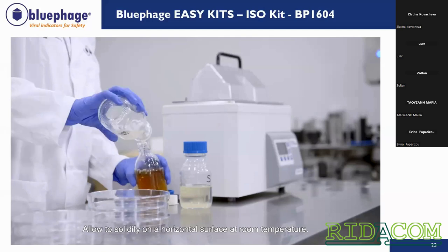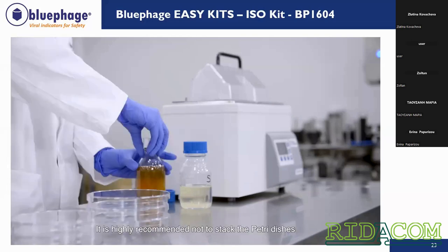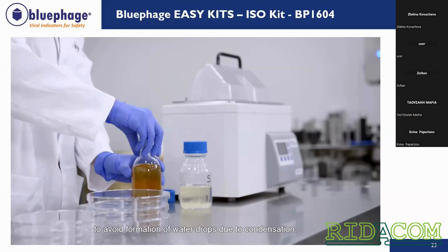So we will allow it to solidify on a cool surface. And after that, we will incubate. After the incubation, we will have these plates. What we need to do is count each plate and sum the results of each plate, of the 5 plates. So that would be the final result of PFU in 100 milliliters, okay?